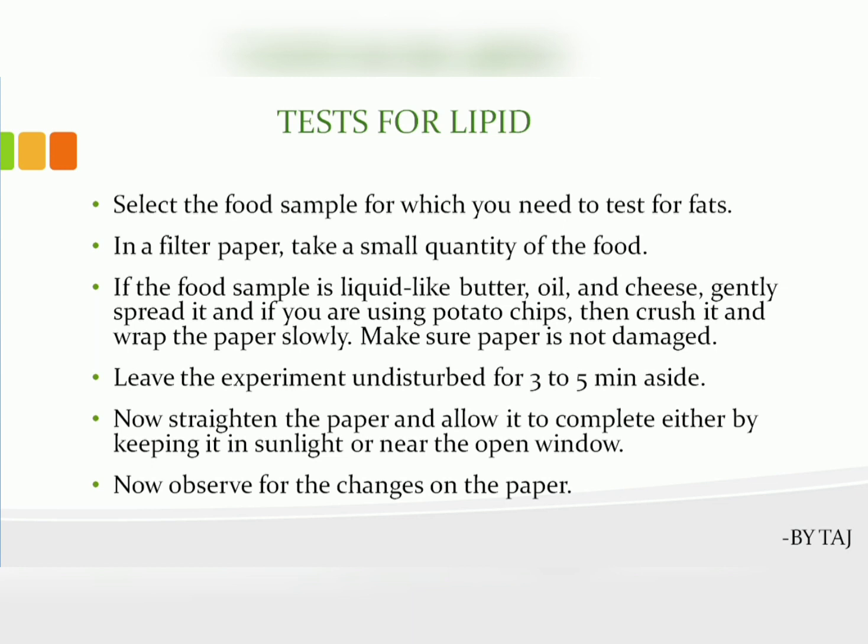Leave the experiment undisturbed for 3 to 5 minutes aside. Now straighten the paper and allow it to dry, either by keeping it in sunlight or near an open window. Now observe the changes in the paper. So this is about the test for lipid.